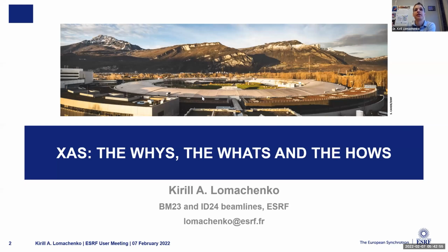Then Steen asks, similar question, but for light elements like lithium, whether absorption would stem from heavier atoms like oxygen or transition metals. Okay, for lithium, this is a big problem that one can face for XAS experiments. Speaking about lithium, it's not hard X-rays, because the lithium K edge will be super low. We cannot reach it at ESRF.